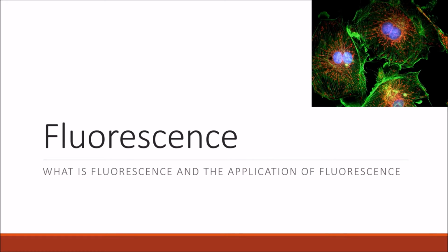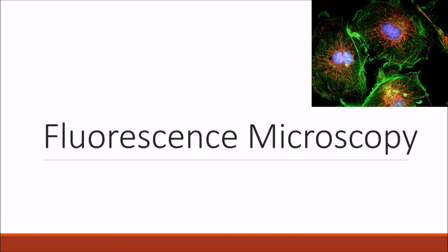So this was the introductory video for fluorescence, and we found out what is fluorescence and a few applications of fluorescence. And we are now going to move on to fluorescence microscopy.